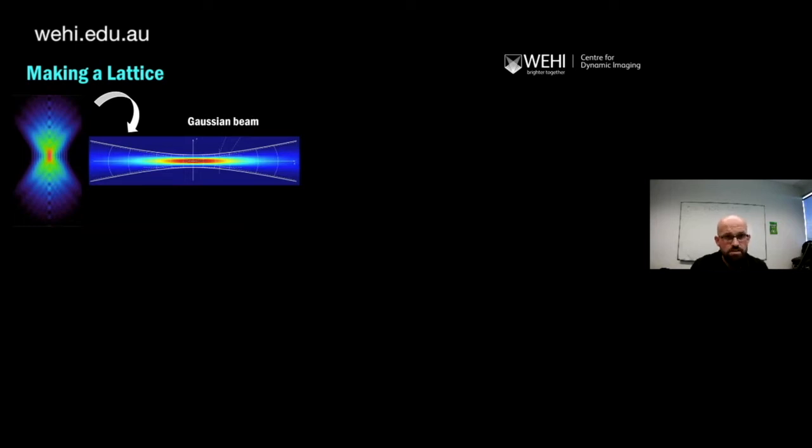So it's much faster than point scanning confocal. The problem is, and this is a problem of physics, when you stretch out a Gaussian light or a focused light spot, it's a Gaussian intensity distribution, the longer it gets, the thicker it gets. So you lose resolution in Z. For subcellular dynamics, this becomes problematic.